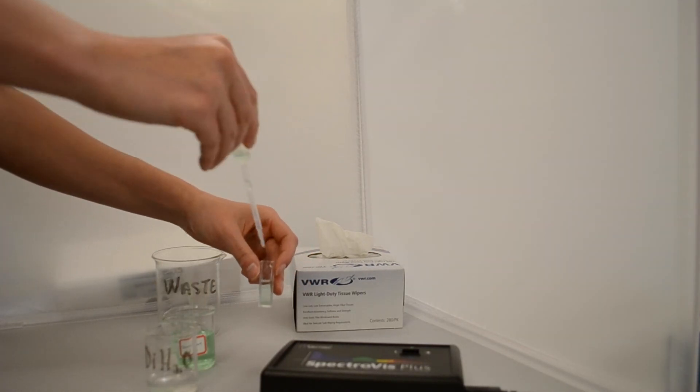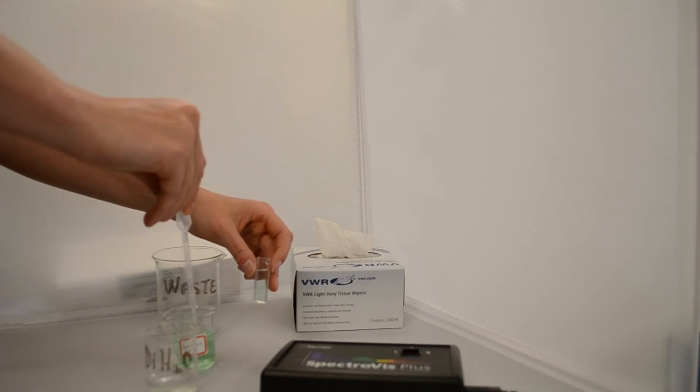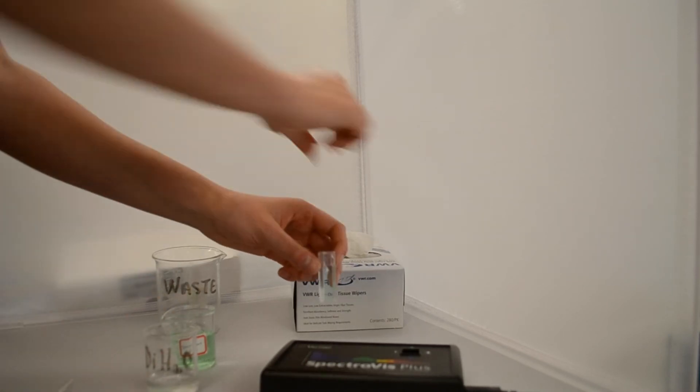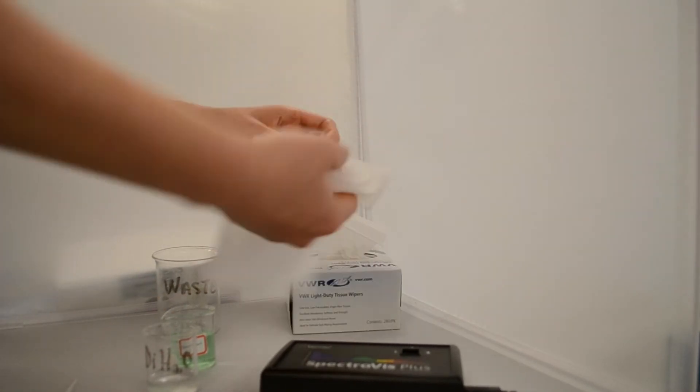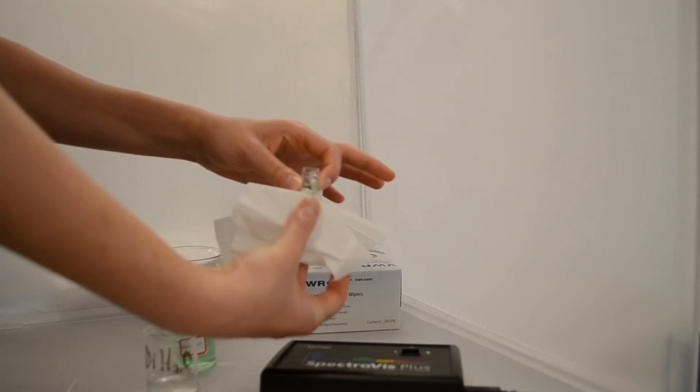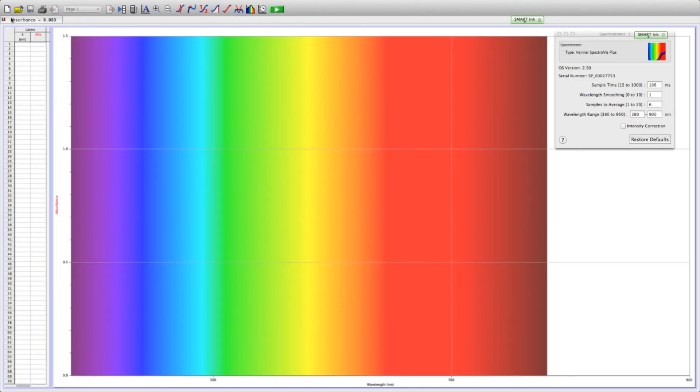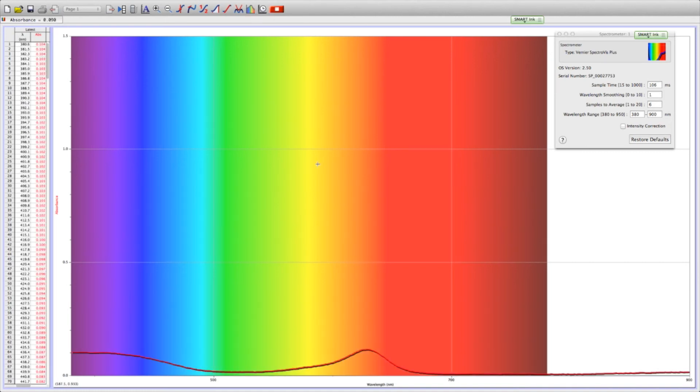Wipe off the cuvette with the chem wipe. Then place it in the spec so that the light is running through the clear sides. Click on the green play button in the top right of the toolbar. Wait about 5 to 10 seconds for the data to be collected.